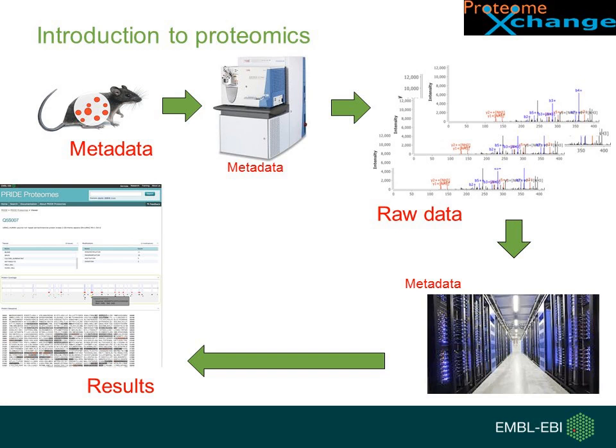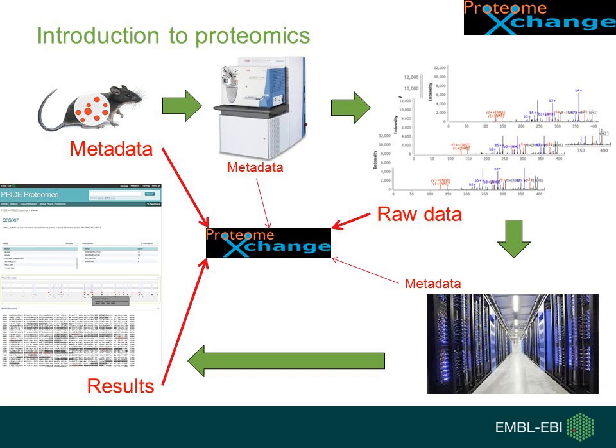Okay, so these are the 3 major data types we are dealing with, which I'm sure all of you are familiar with, even if from a different scientific domain. And all of these we want to store within ProteomeXchange and make accessible to the scientific public.